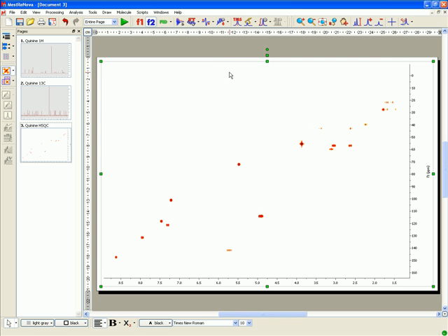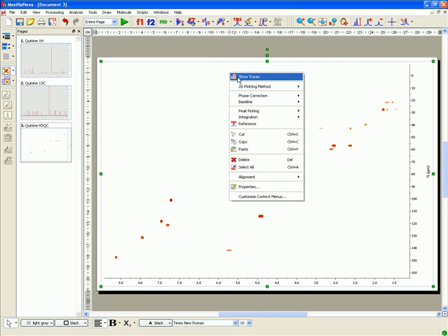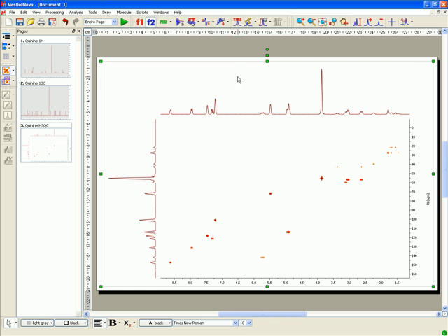You can show the traces of the 2D NMR spectrum just by right-clicking over the spectral window.